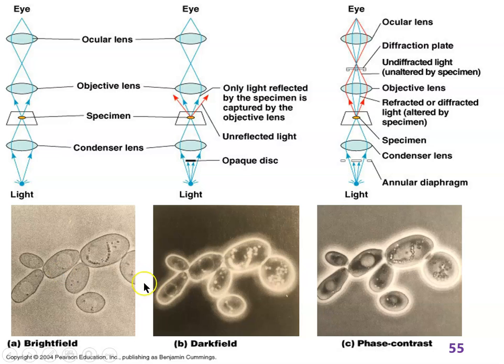So this picture is not what you want to see. You want to see much better contrast. So bright field you'd use more for histology slides.